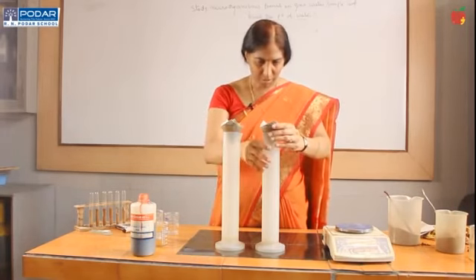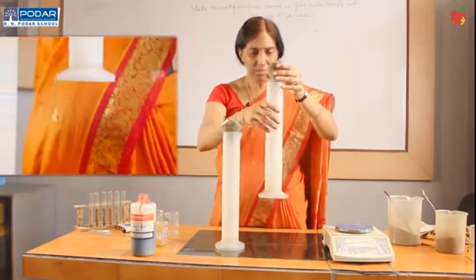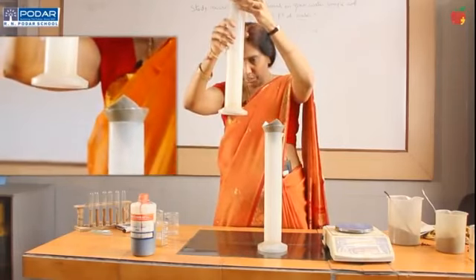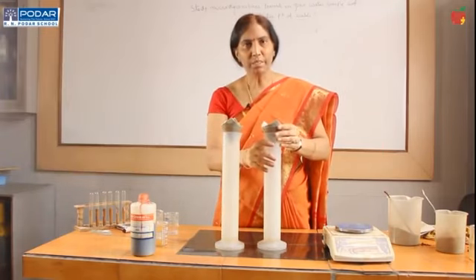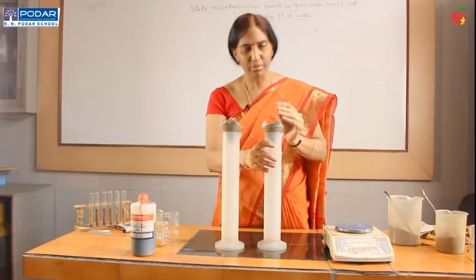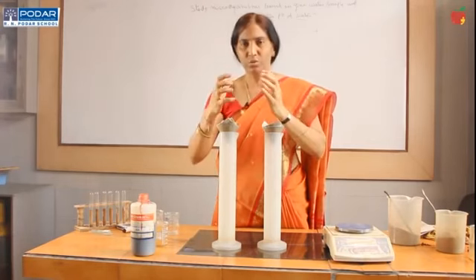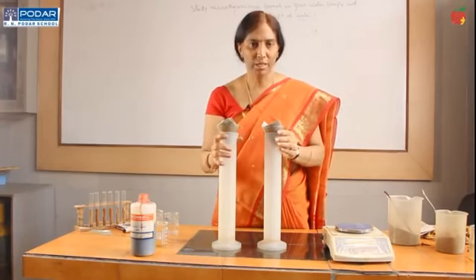Now, let us see the amount of water collected in both the cylinders. The first cylinder, which has garden soil, has 30 ml of water in it, whereas the cylinder having roadside soil has more water, 40 ml. That means garden soil has the capacity to hold water. This is because of the porosity of the soil. In garden soil there is no space between the soil particles because of the humus present in it, whereas in roadside soil, the particle size is larger and the spaces between particles are also larger. So whatever water you give is percolating through. That is the reason for the water holding capacity of the garden soil.